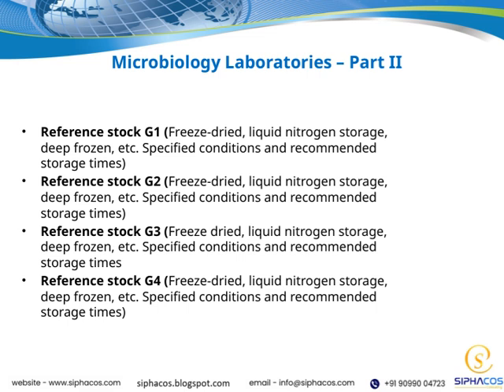Proper storage ensures the quality of your microbiological samples is maintained, which is essential for accurate and reliable laboratory results. Overall, understanding these storage guidelines helps us manage our reference materials effectively, ensuring consistency and reproducibility in our microbiology work. This is a key part of maintaining high standards in our laboratory practices.